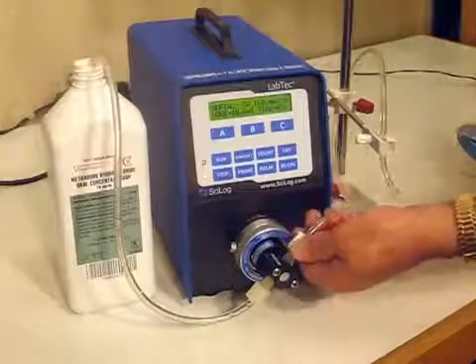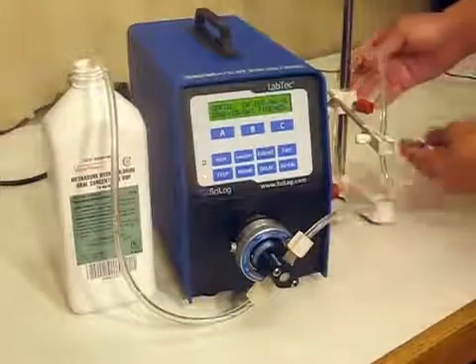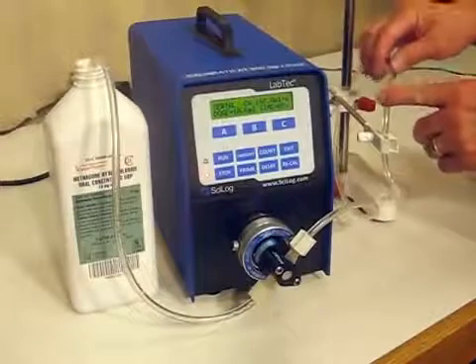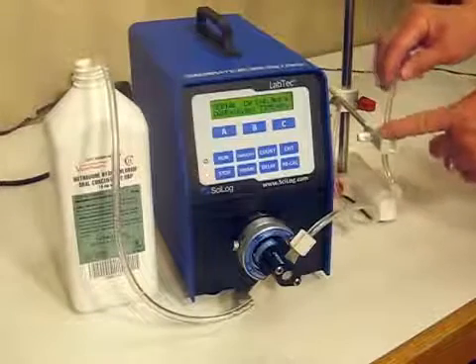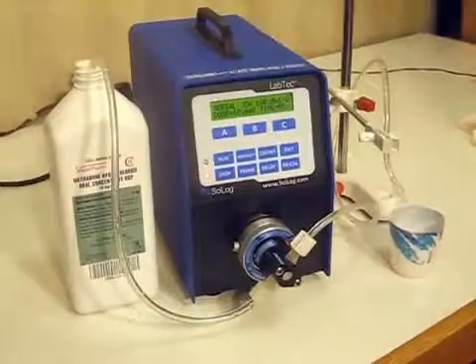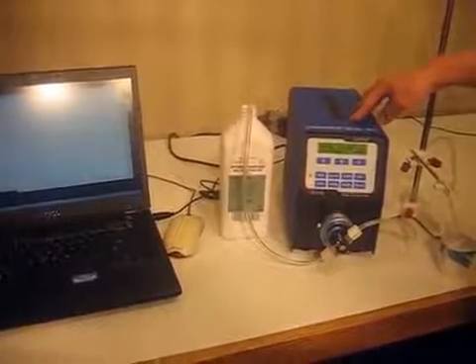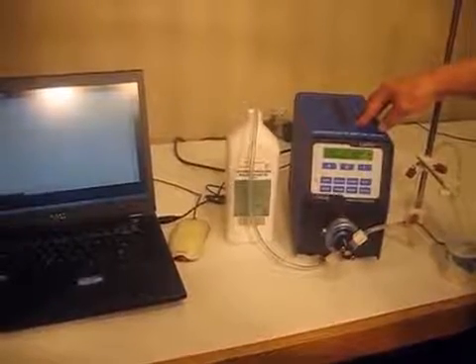On this side is the output, and the methadone comes out of here, goes through the tubing. The dispensing tip is held by our standing clamp, and it is hands-free dispensing. The pump is now ready to receive a command from your PC patient program.